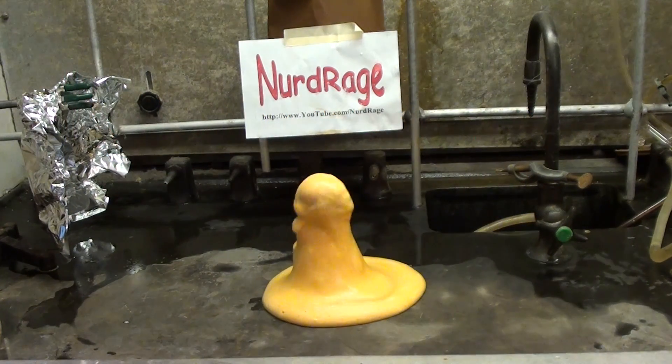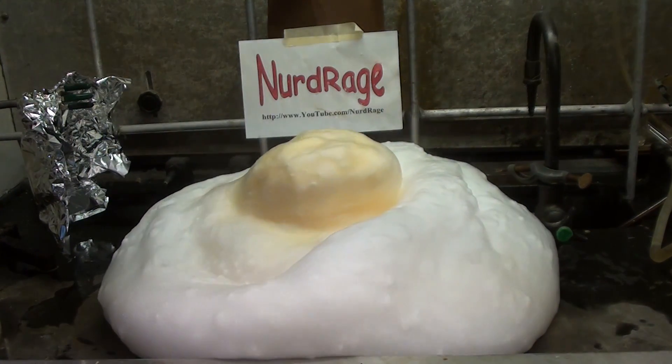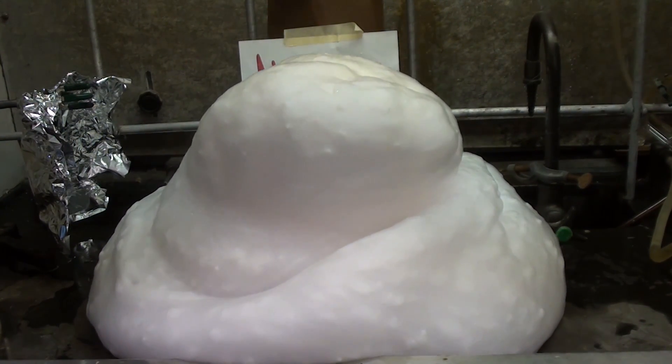Greetings fellow nerds. In this video we're going to do the classic demonstration of elephant toothpaste, which is actually just a fast expanding foam.